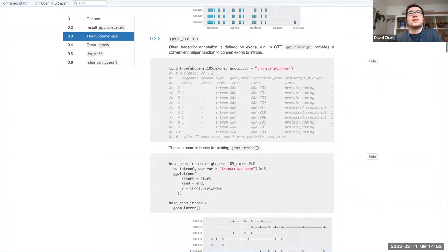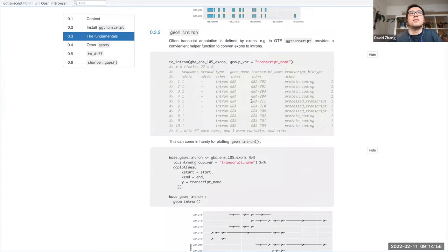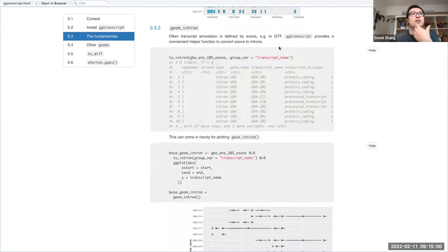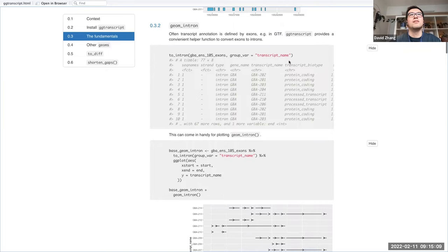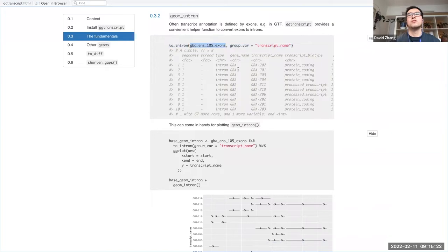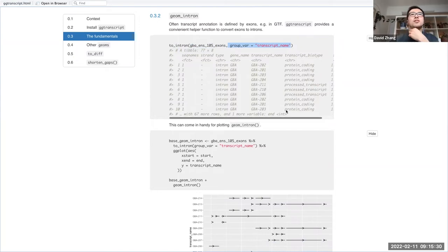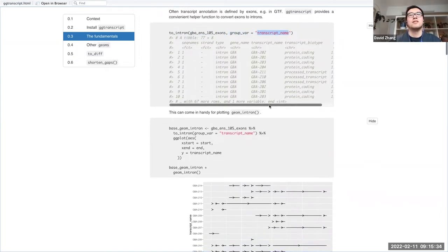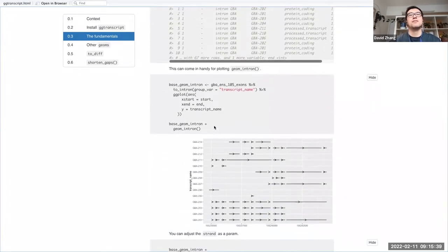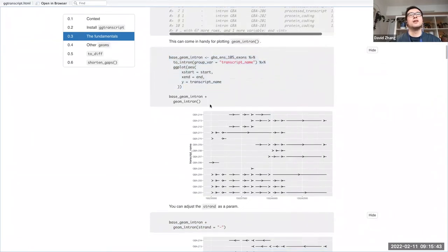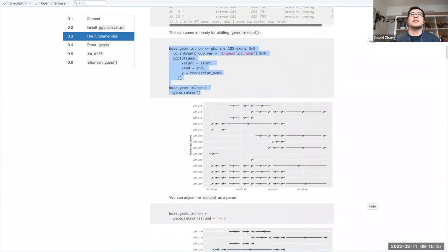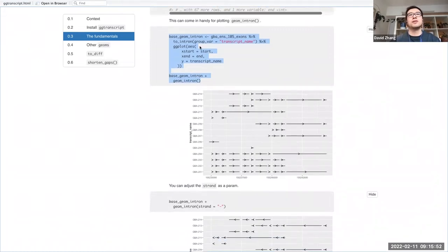The other important component is geom_intron. Often transcript annotation is defined by exons — in GTF format, for example, you don't necessarily carry introns with you. GG Transcript has a convenient helper function that converts your exons into introns called to_introns. You put in your exon file with a start and end, and also the group — for example, transcript name or gene — and this differentiates the exon groups. This means you only need to have the exons as input because you have the to_introns helper function.